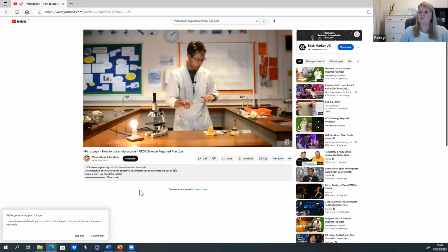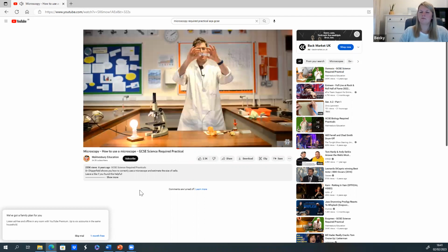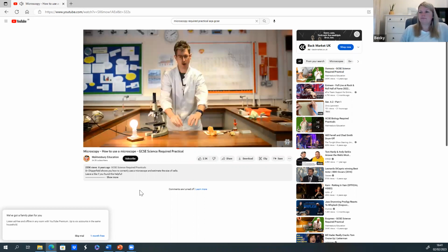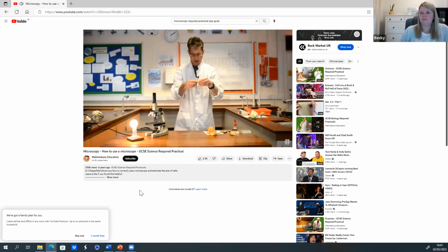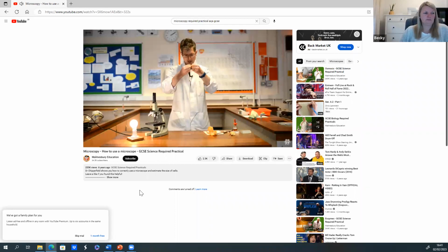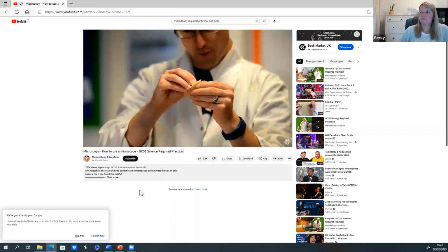Now, to set up a specimen using our microscope, we need to collect a glass slide. Please carry them like this, to touch the edges only, so avoid putting greasy fingerprints all over our glass surface that would make it hard to see our specimen. We need to collect a bit of onion skin. So get some onion, break some bits off it, and generally if you split a small piece of onion, you're looking to get a thin layer of skin coming loose, and then you try and peel that layer off. You can use your fingers or a forceps. Fingers work just fine though.